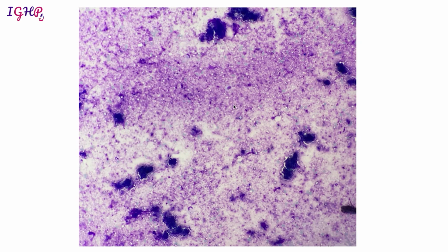So for a morphology like this, if you know that the patient had a history of chronic pancreatitis, and if her amylase levels are also very high, then you can say that this is diagnostic for a pseudocyst. So you can say your findings are compatible with a pseudocyst morphology. And if you are unaware of the amylase level and you do not know about the history of pancreatitis, then you can say that this cyst could.